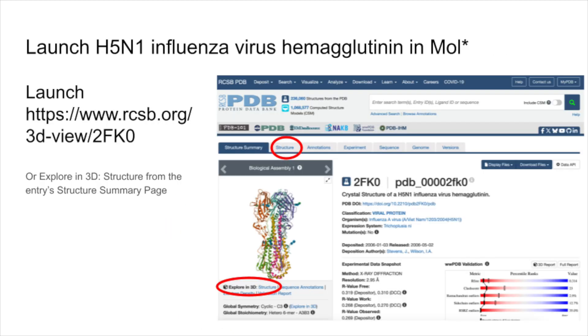To begin, open your web browser and go to rcsb.org and open the structure of interest. Use the search bar to enter your structure's PDB ID. For this tutorial, we'll use 2FK0, a protein from the H5N1 virus.